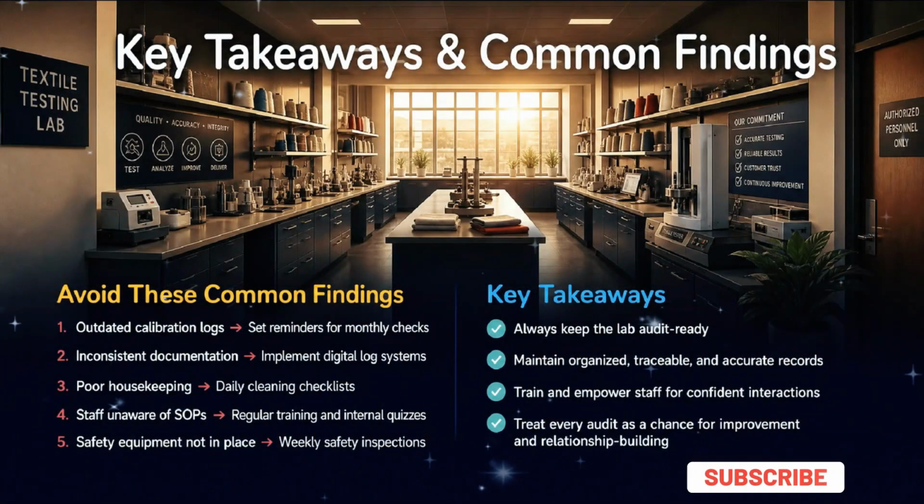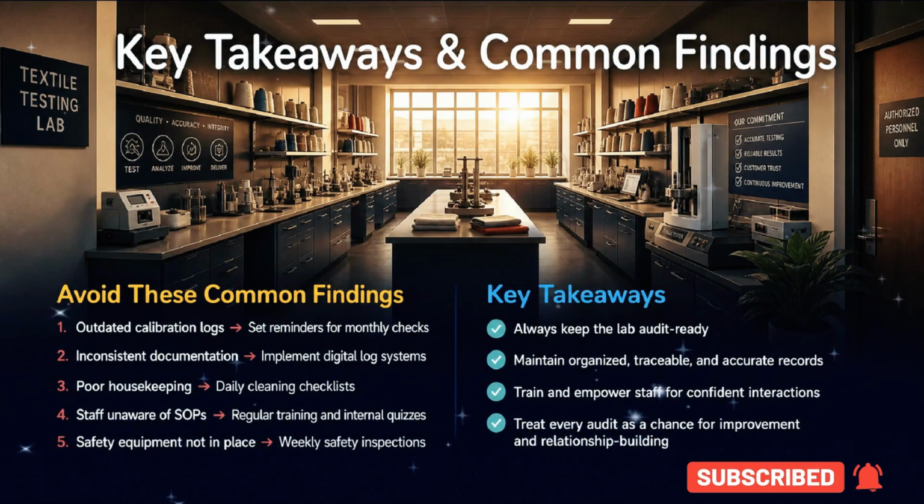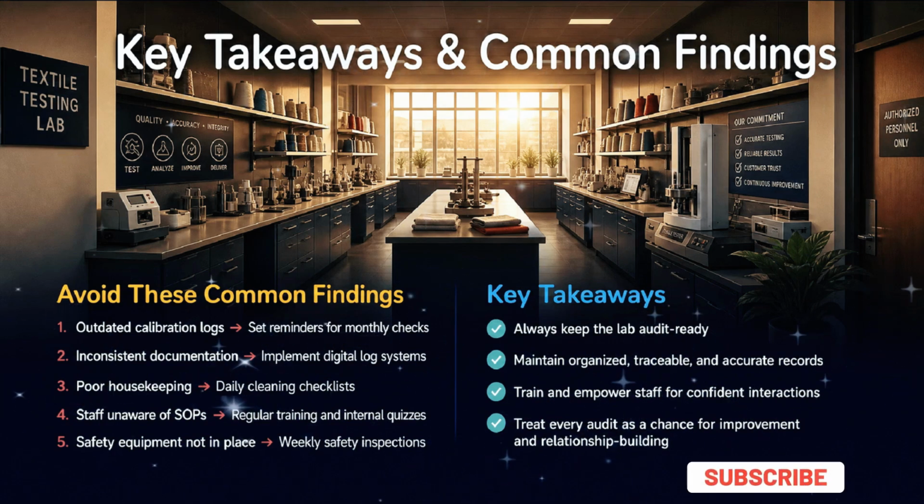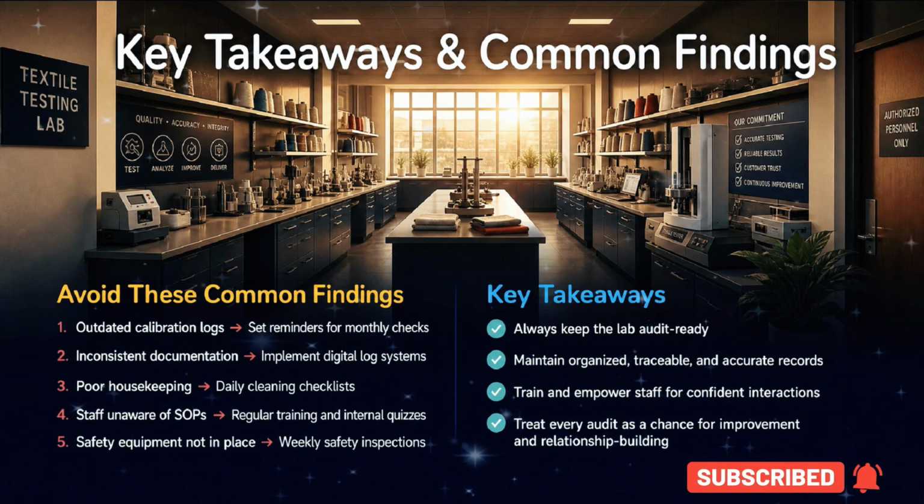In summary, avoid common pitfalls like outdated logs or poor housekeeping by implementing regular systems. By training your staff and treating every audit as an opportunity to improve, you will maintain a superior lab standard.